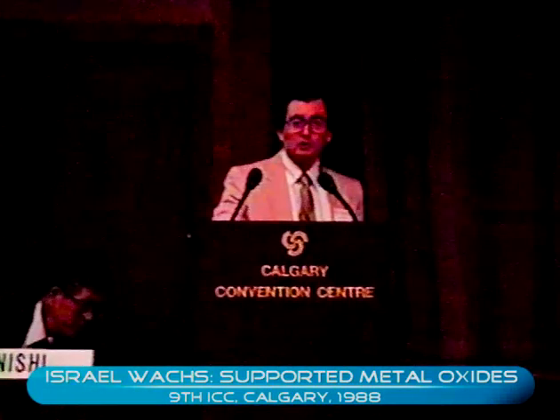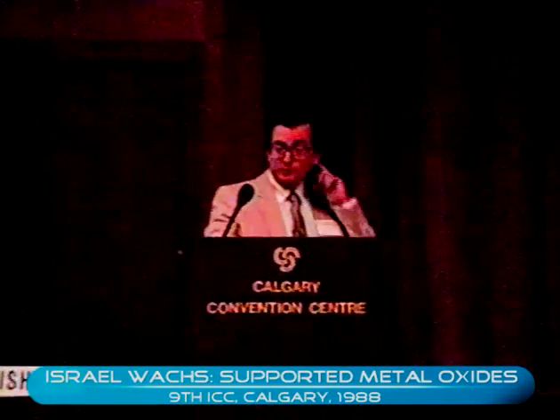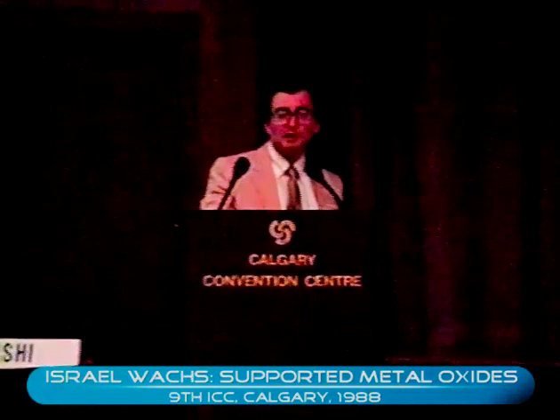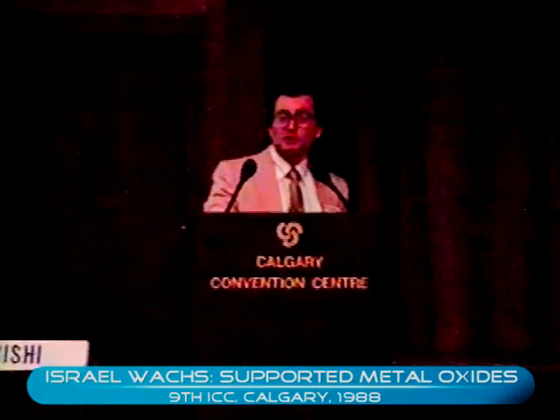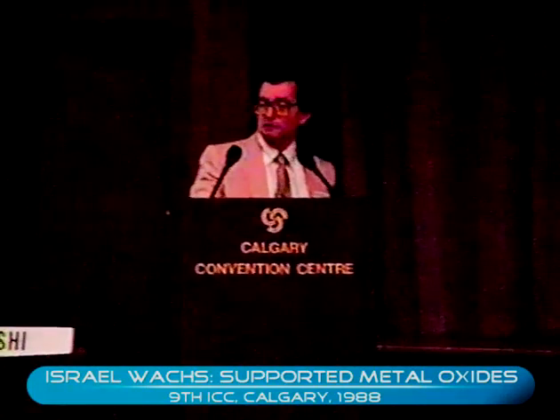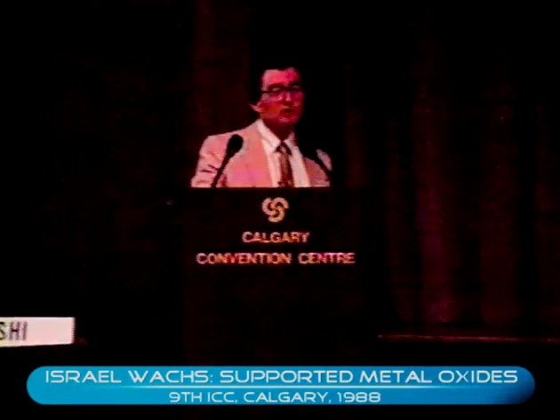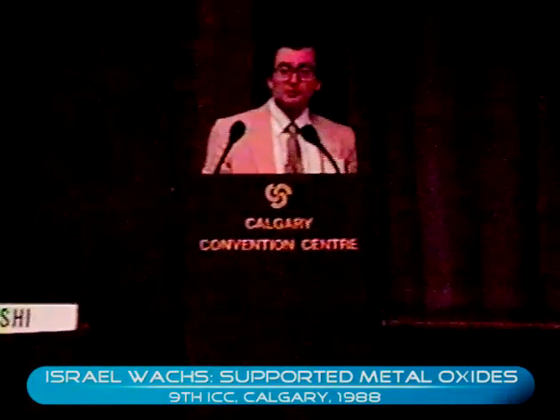Over the years, looking at how to study oxide-oxide interactions and interfaces, it became clear to me that one of the best approaches was to use the technique of Raman spectroscopy. What I'd like to do today is give you an overview of what Raman spectroscopy can do and tell us about how metal oxides interact and interface. To do this, I will look at three conventional supports, prepared by conventional methods of incipient wetness: alumina, titania, and silica. Now look at various metal oxides and how they interact with these supports.